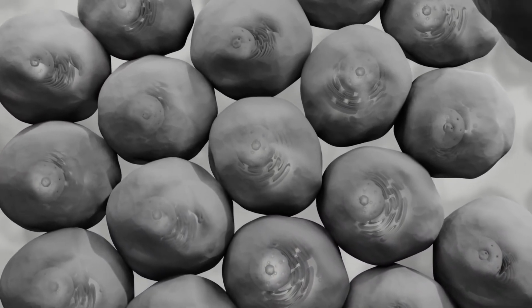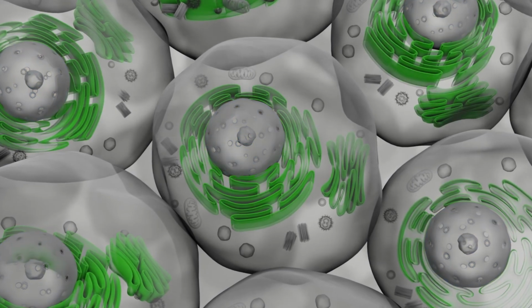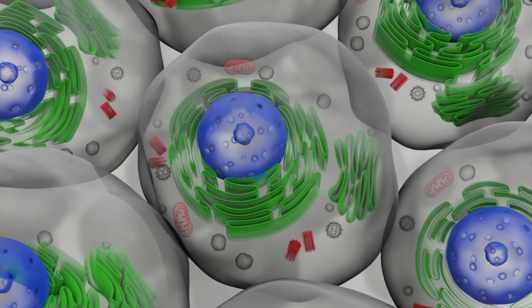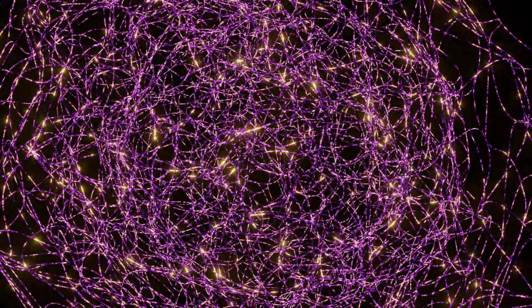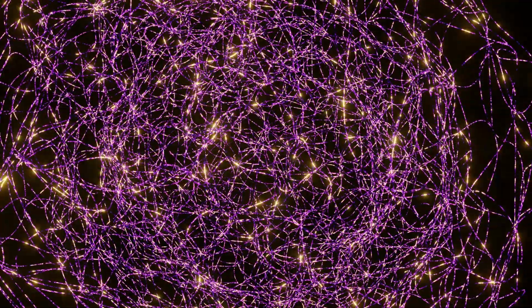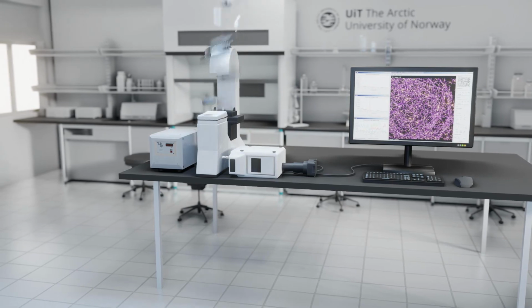A fluorescence microscope is unique in its function, as it operates using a special light-emitting molecule, one that is engineered to bind to a determined cell structure or molecule, giving it a high level of signal specificity. Whereas optical resolution is typically limited to around 200 nanometers, so-called super-resolution fluorescence microscopes use special techniques to beat this limit, at the cost of being typically bulky and very expensive.